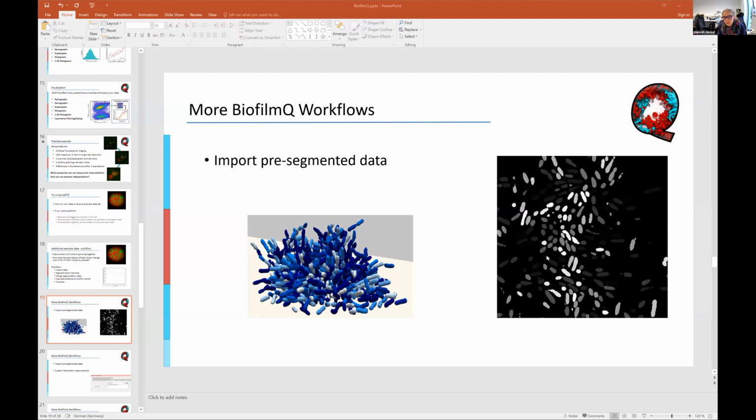So this is what these label maps, or label images, look like. This is just one slice, and the intensity values correspond to a kind of cell ID. This is something that you import, and then you can use your neural network-based segmentation, and instead of using cubes as objects and calculating everything for cubes, it's going to use your cells as objects and calculate everything for cells.